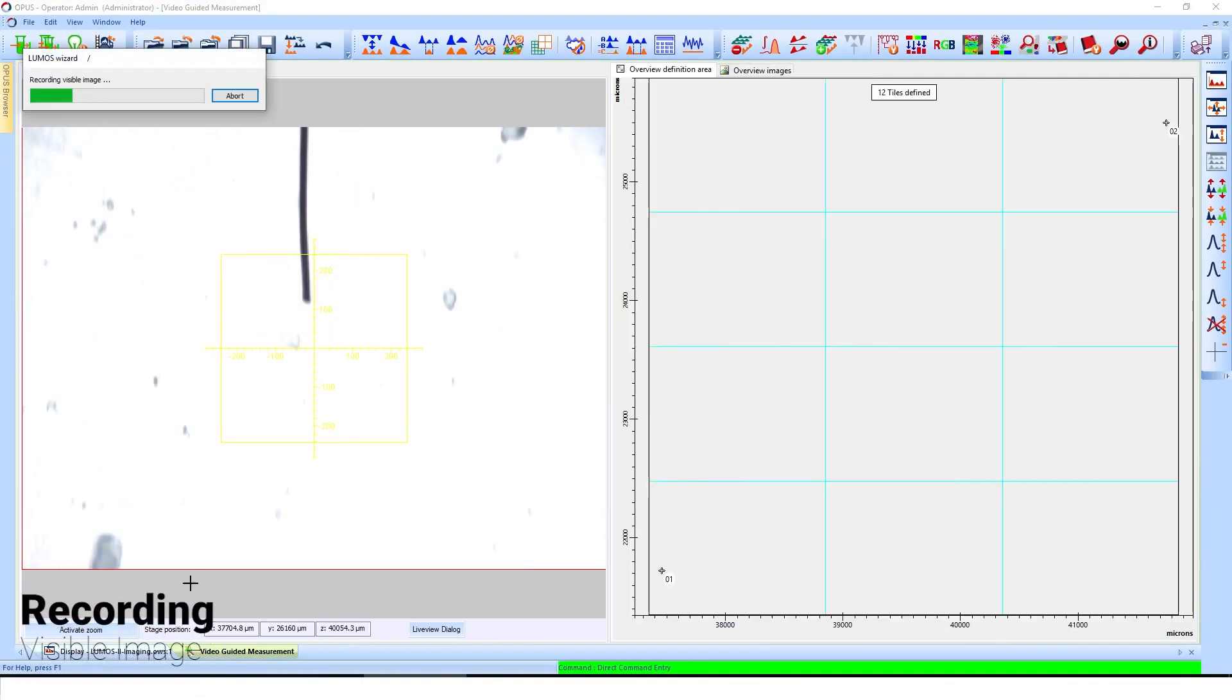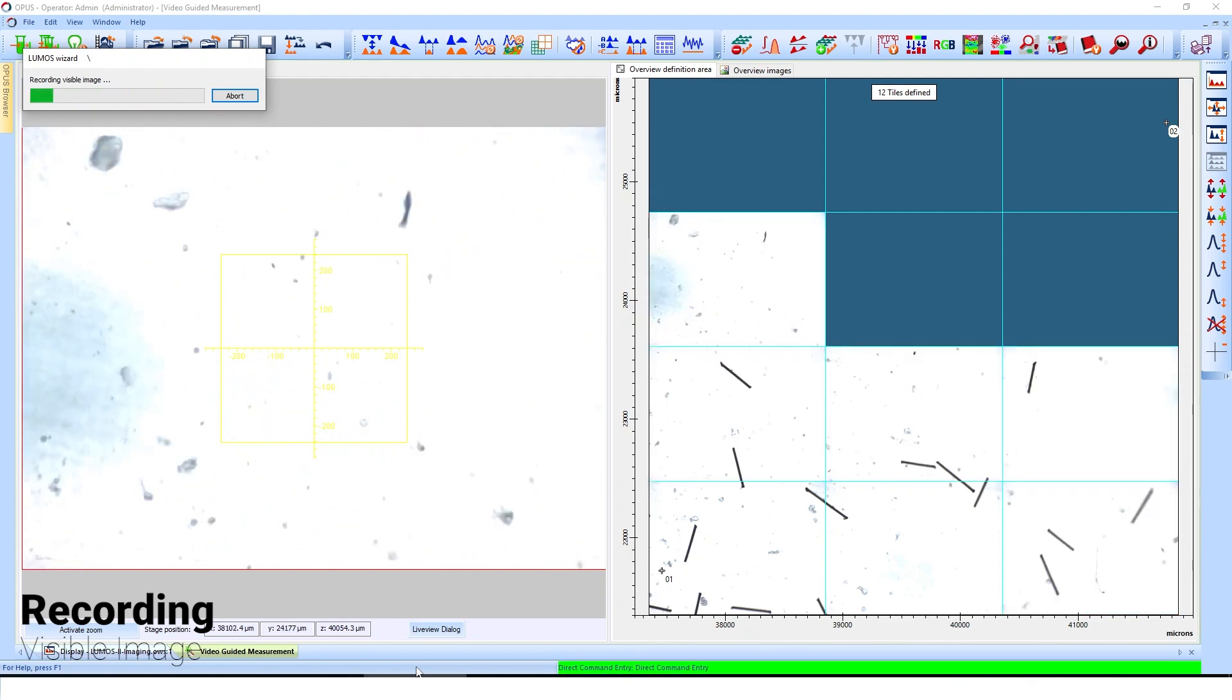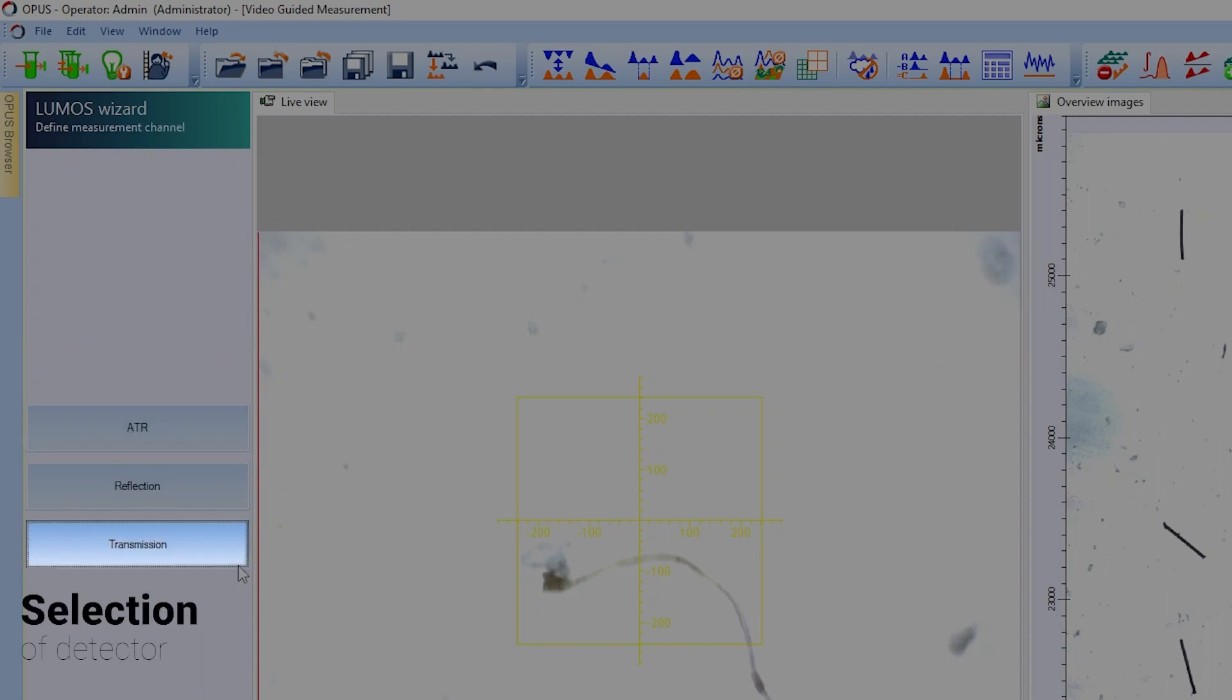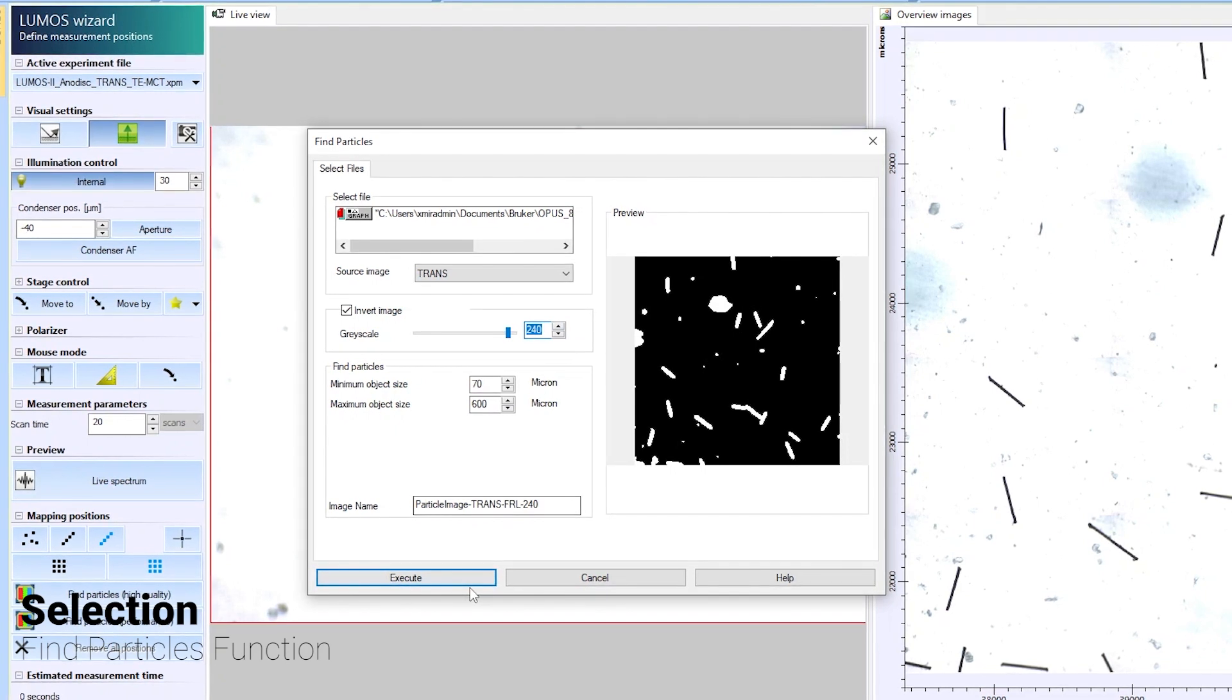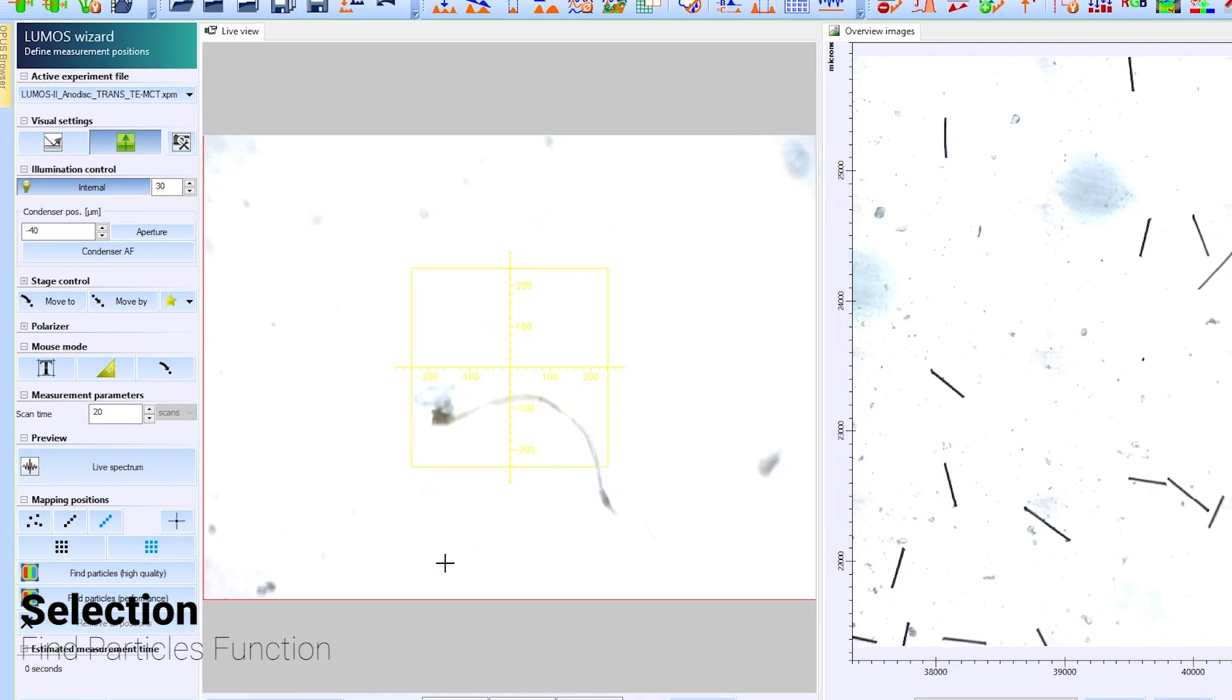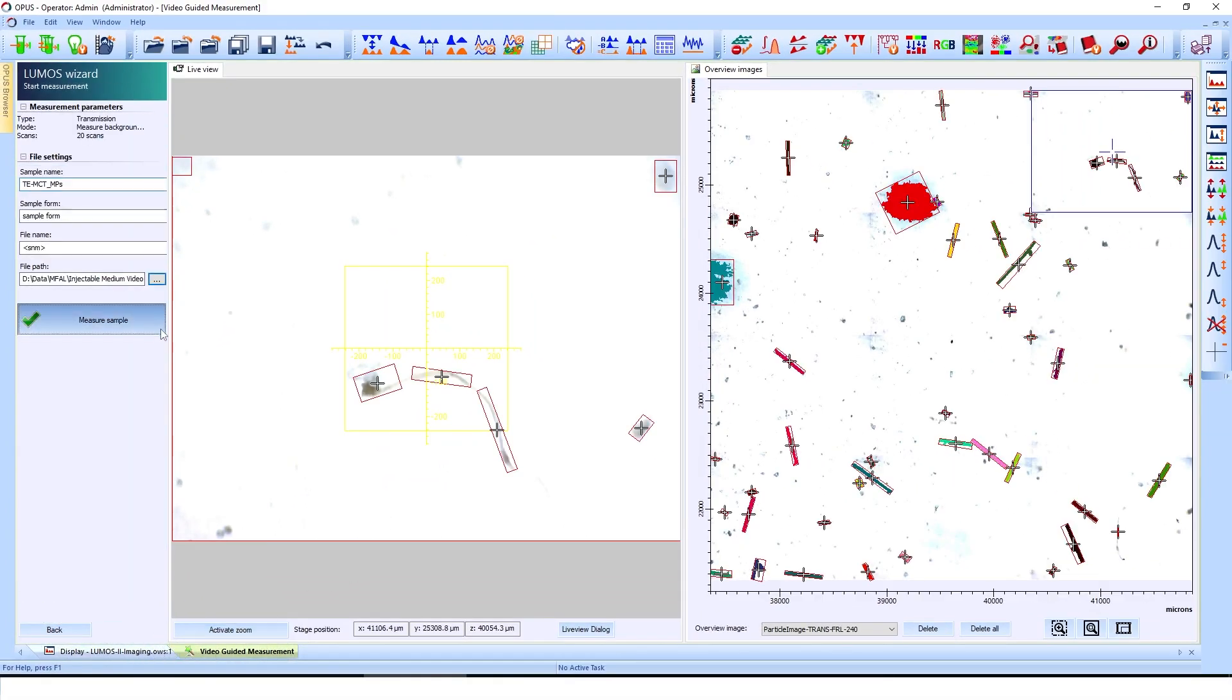We begin by capturing a visible image of the sample's region of interest. This could be any size, even the whole filter. Next, we select a single detector in transmission mode and use the Find Particle function. Particles on the filter are then detected based on the visual image. This assigns an FTIR measurement point to each particle fully automatically. With one more click, we then start the analysis.